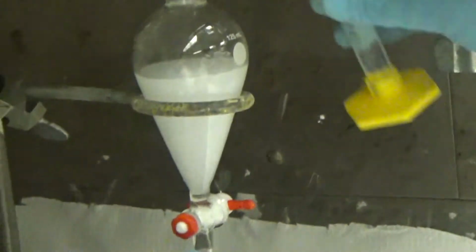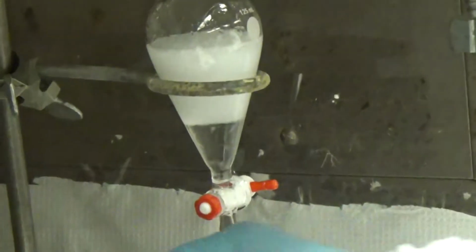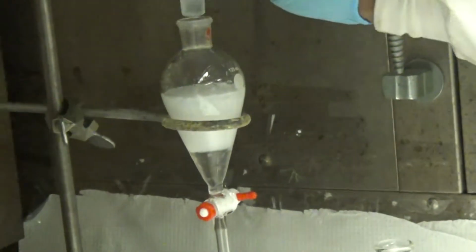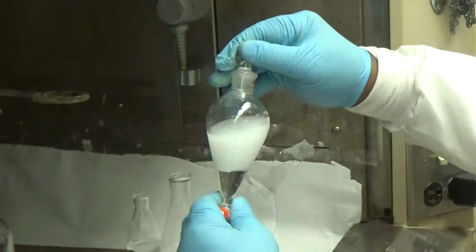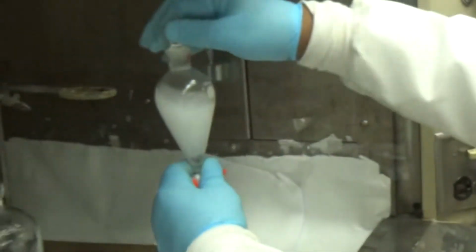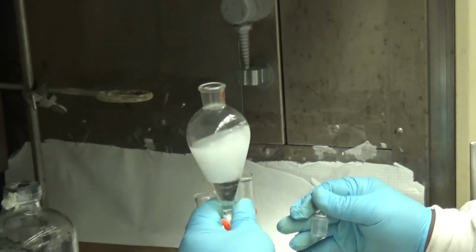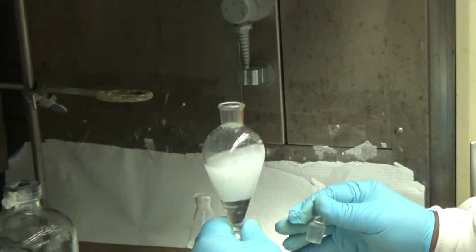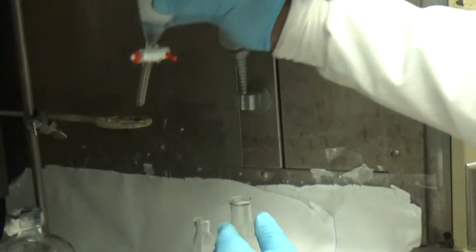Okay. Now we are going to do the second extraction. Go. Shake it. You can also vent from the top. No problem. I like that because if you vent from the bottom, sometimes you shoot people accidentally. If there's a neighboring person, you might shoot them. It's better. Sometimes it squirts out the bottom, but if you vent from the top, it doesn't squirt out. Yeah, that's good.